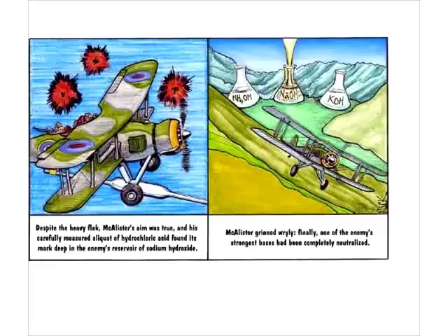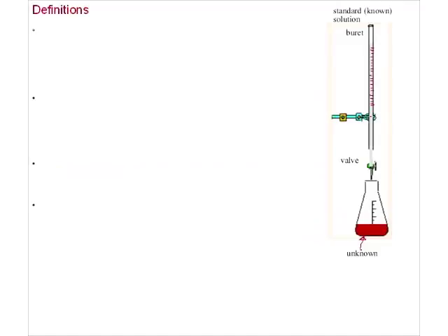So that's our task here in titration: to be very, very precise in our aim, and very precise in what we're doing. We want to try and neutralize an unknown compound, and by using a precise amount, we can do a few calculations to figure out the concentration of an unknown acid or an unknown base, depending on what we're trying to do here. So let's have a look.